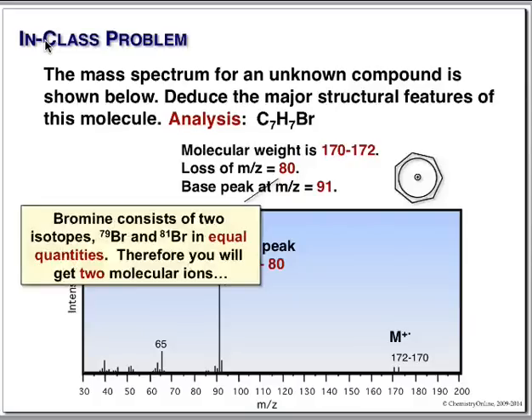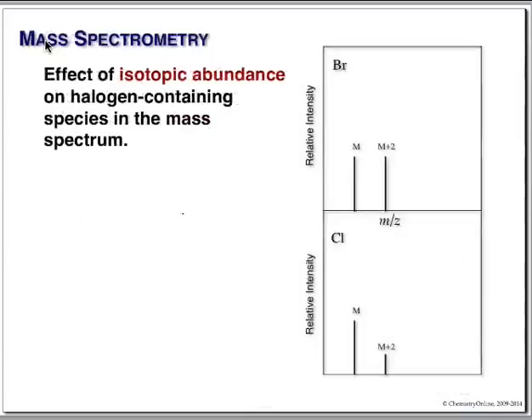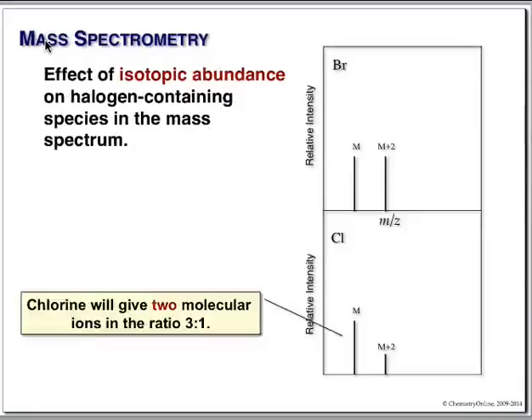So let's put this together. This used to be a benzyl group. We had a bromine attached. Only way they go together is to make benzyl bromide. Now the isotope stuff here works really well for bromine and chlorine. Bromine, we have equal concentrations, so we'll always get an M and an M plus 2. Average is right in between, M plus 1. Chlorine, we have two peaks, in a 3-to-1 ratio. I forget the numbers. I guess 35 and 37, something like that. Whatever. But again, 3-to-1, bromine is always 1-to-1.